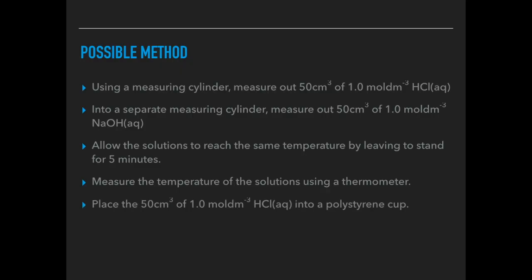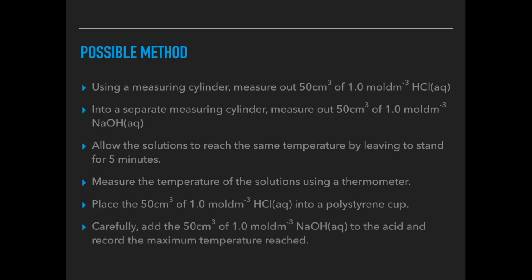Place that 50 cm cubed of, I've gone for the acid, into the polystyrene cup. You could have gone for the alkali, that's not really important. Then carefully add the other solution and record the maximum temperature reached.